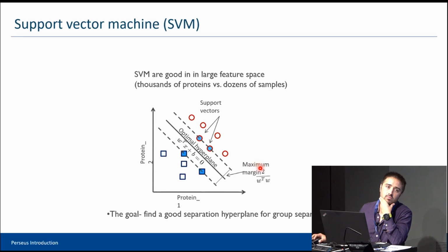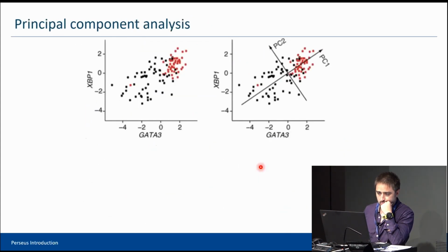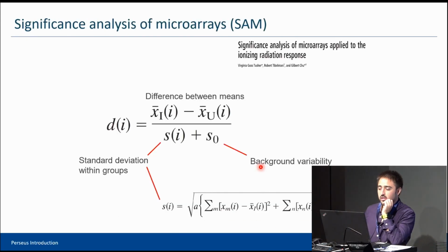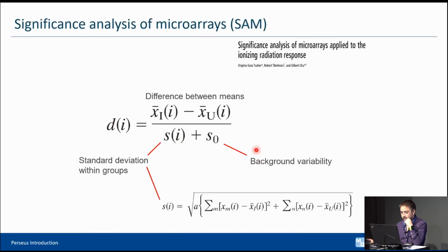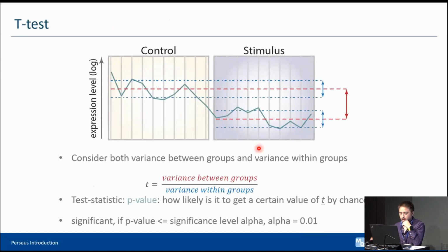I wonder if we could just go over that parameter S, which gives the correction, one more time. Yes. So you mean this one? Okay. Exactly. And let me actually just, probably this one is easier. Exactly. So the variance, exactly. Let's say this is without the S0. Without the S0, this is exactly what you're seeing here.